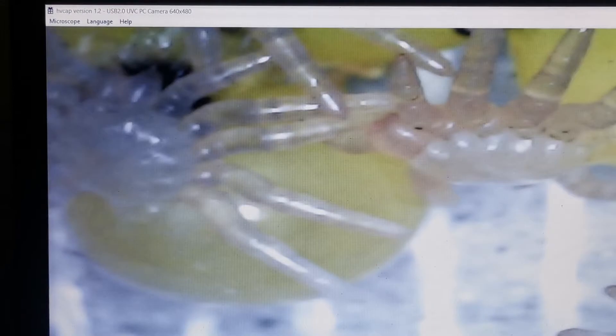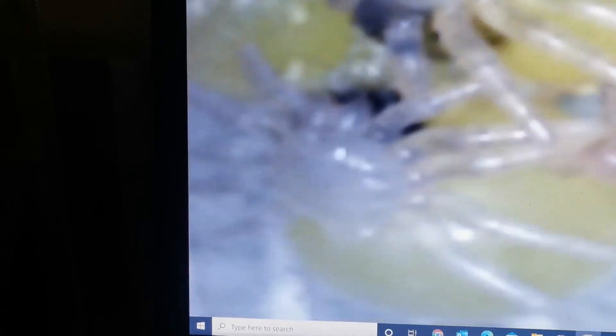These I just wanted to show you guys quickly before I finish up. These are the actual eggs with legs again. Quality is not going to show up as good because phone to laptop, but you guys get the point. Some of them are still shedding. That one is busy eating another one and it's already gone rotten. See it sucking up the juices. Very cute little things. But yeah, in case you guys are wondering, these are baby tarantulas, eggs with legs.